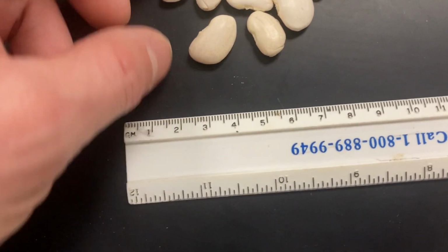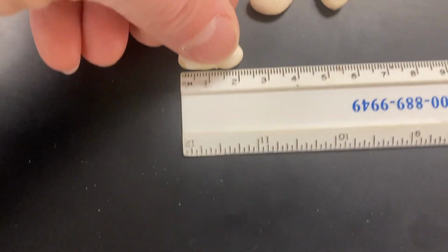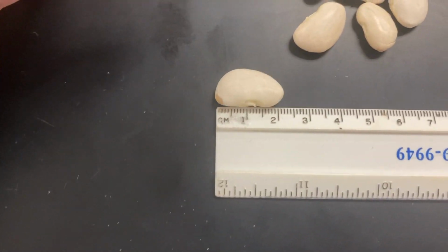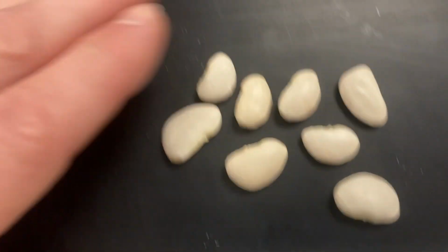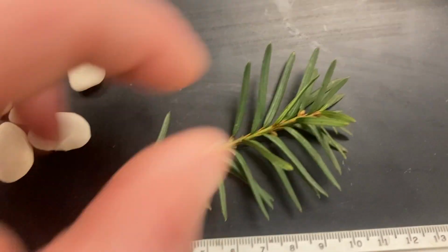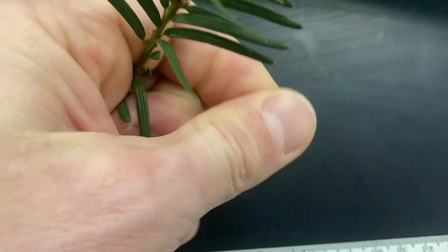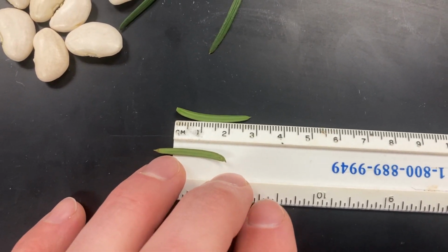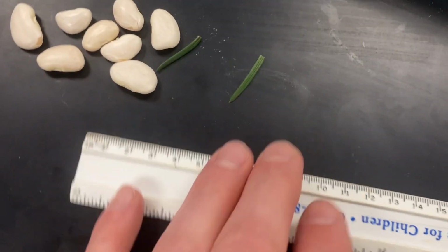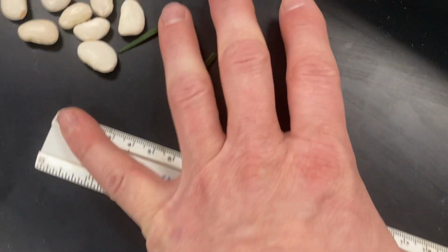Okay, so we came down to lab and we measured out some seeds against a ruler here. Okay, so we did, I think, 20 seeds. And then, to see if there's variation, you can already see there's some different sizes there. Then we also did needles off of this little yew tree. So we pulled needles off, hard to do with one hand, and then we made measurements of those with a ruler. And then the last thing that we did, of course, was to measure the length of our hands in centimeters, okay?